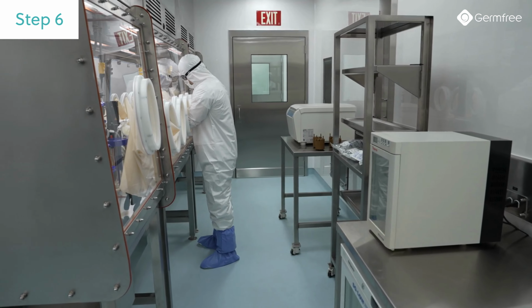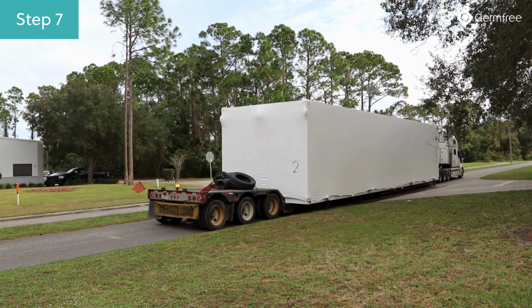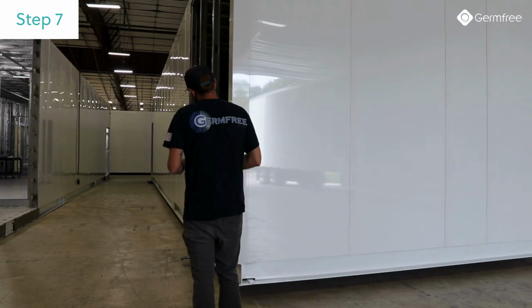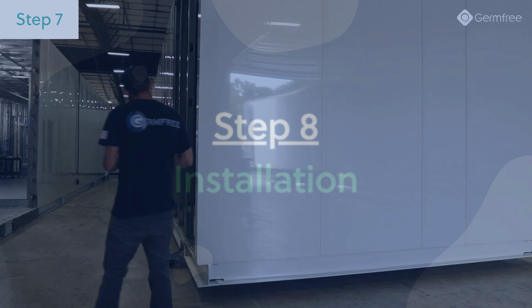From our factory to your site, every module is handled with care. Germfree carefully manages the rigging and shipping process for every component of a project. That means verifying dunnage placement, load security, and proper truck fitment, all to ensure safe, damage-free transport. Some of our modules weigh up to 40,000 pounds, so expert handling is key to maintaining structural integrity during transit.